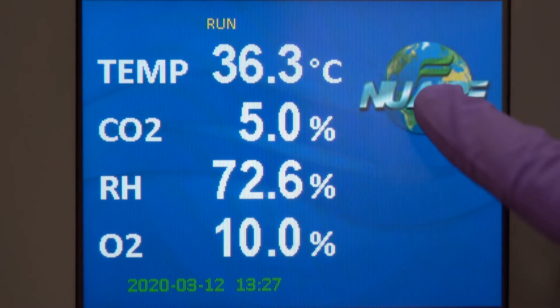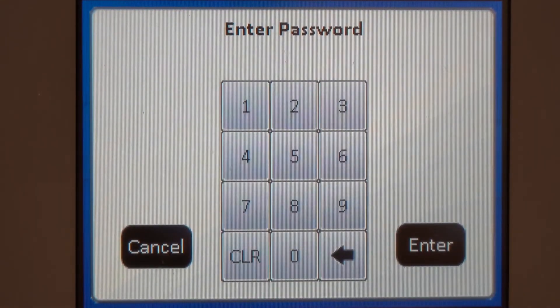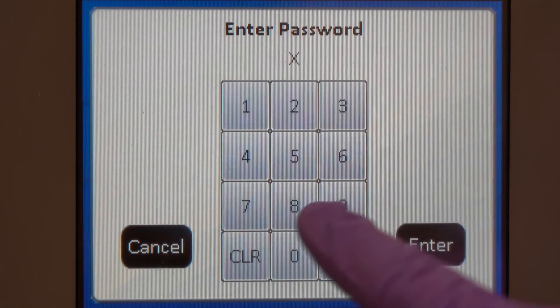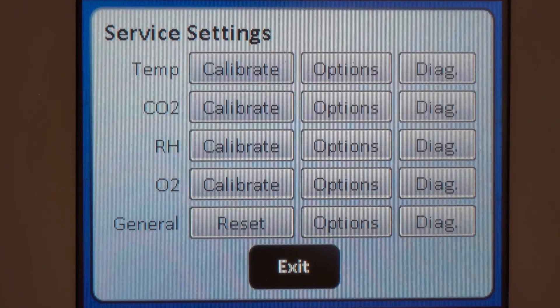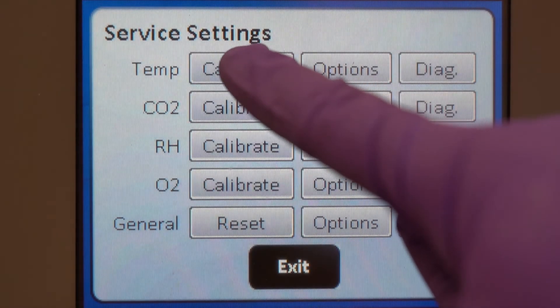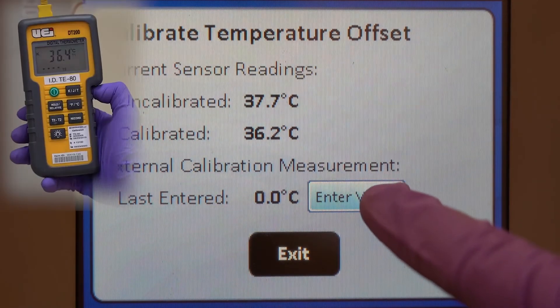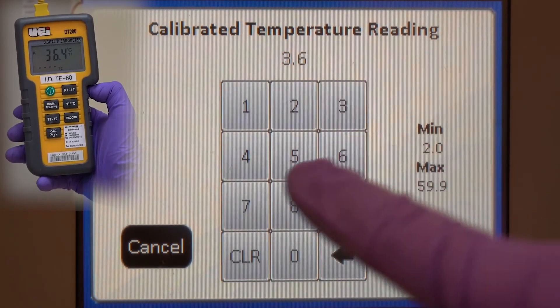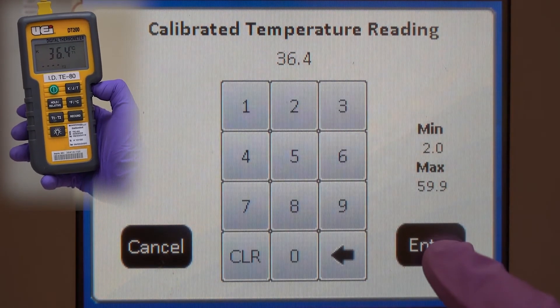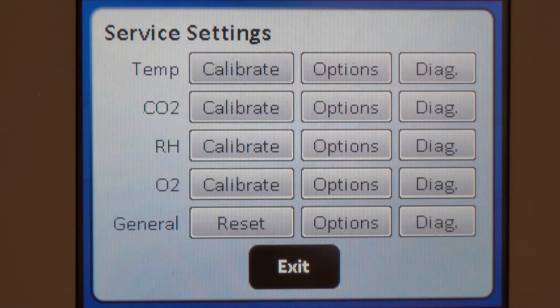Enter the service settings menu to reach the calibration screen. Enter the reading from your independent instrument as the calibrated temperature reading. Save your calibration and exit back to the main screen.